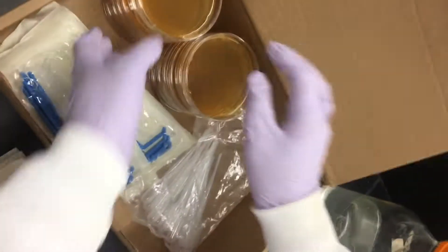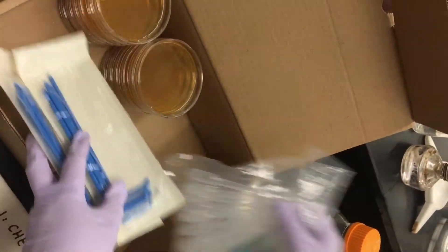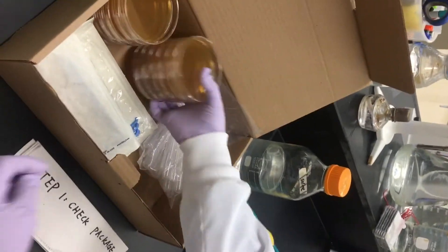Check the package. You can find the plates, T-shaped spreader, and plastic transfer package. Nothing should be growing on the plates at this stage.